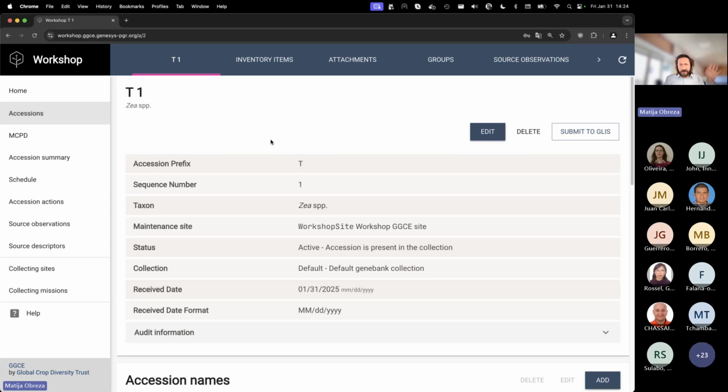That tree has a location, a name, and GIS coordinates because you know physically where on the planet it is, but it's one tree.